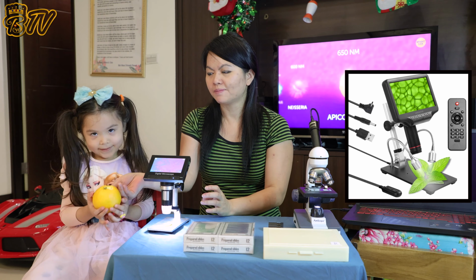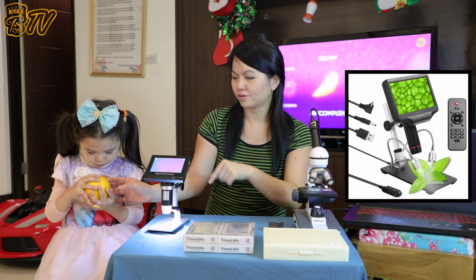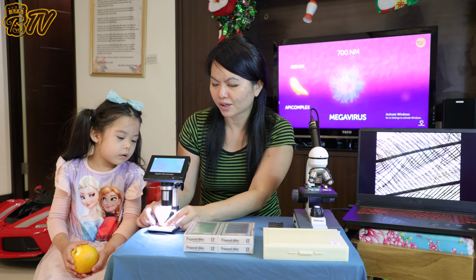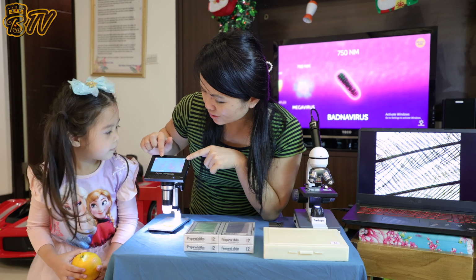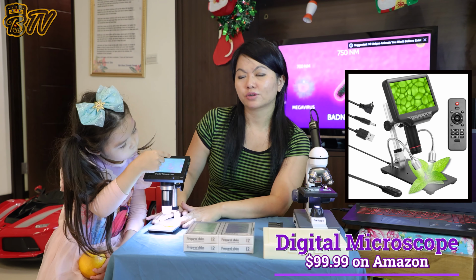Hold the orange for mommy. If you look closer, I actually peel off a tiny piece on the orange, and this is the orange peel. You put the orange peel right under the microscope, and you turn on the screen. This is how you view it. And you can see, Annabelle, come see. You can see the orange peel straight from the digital microscope. This is another type of microscope.